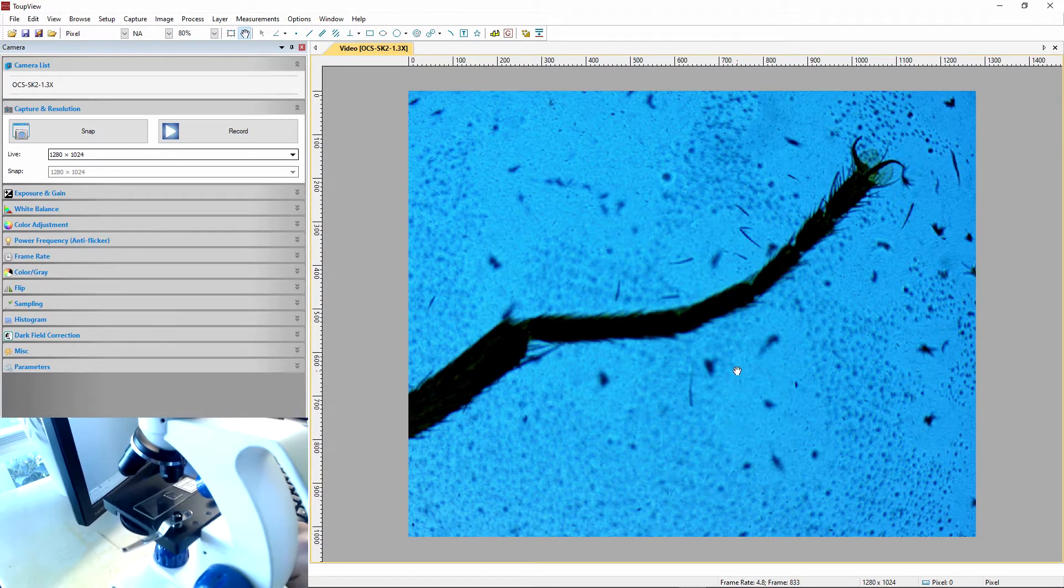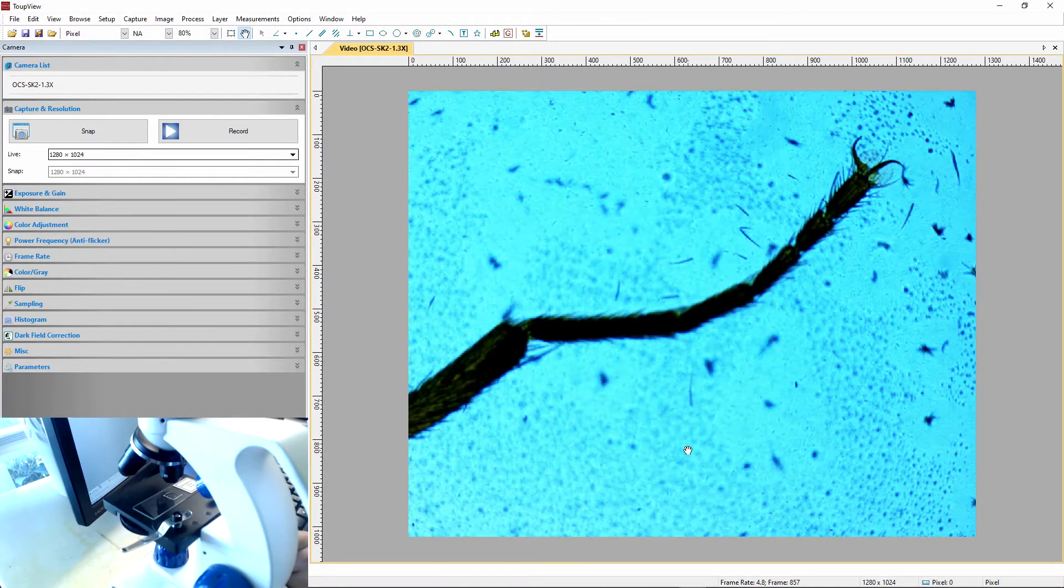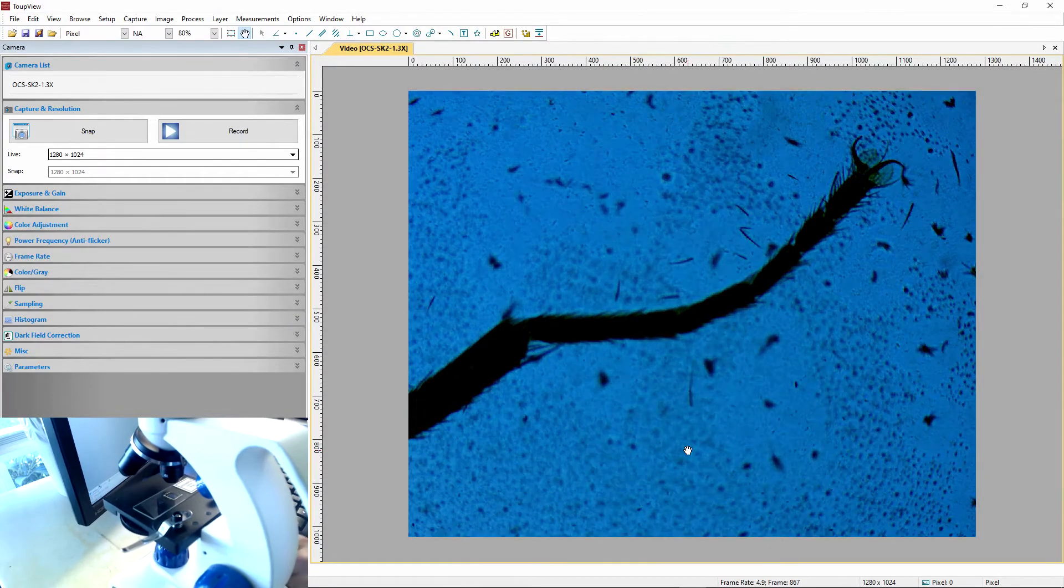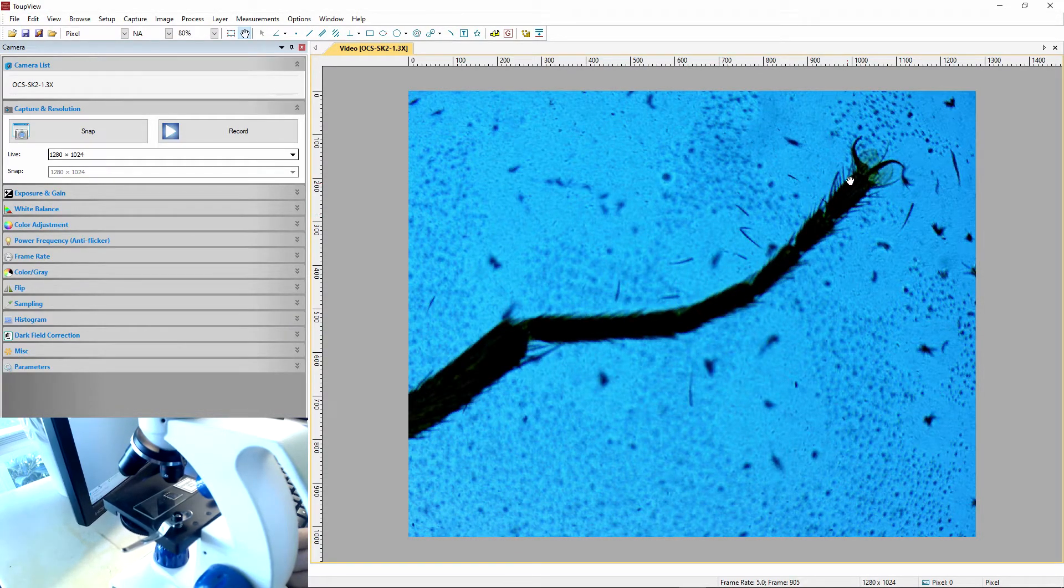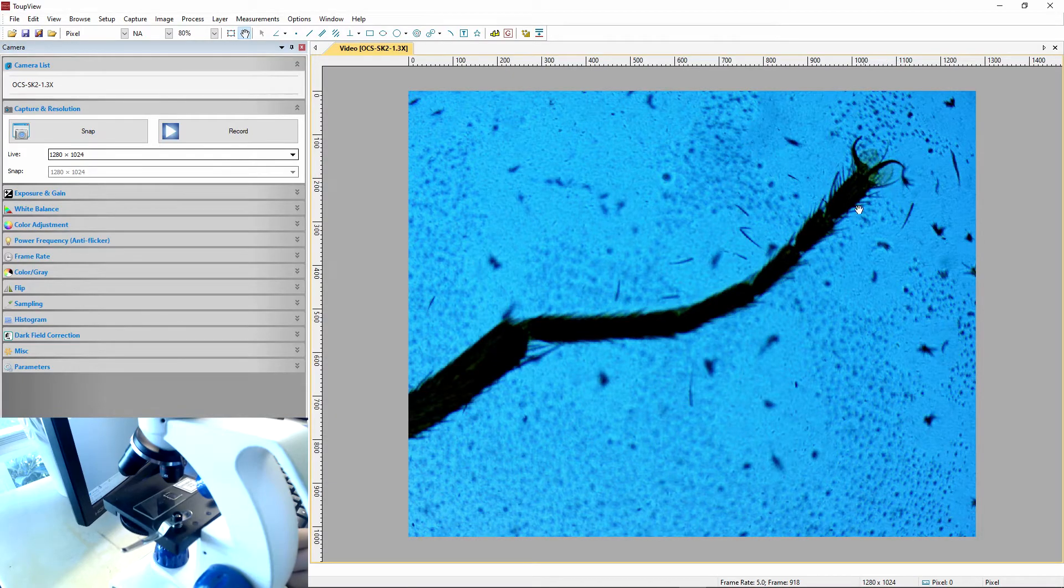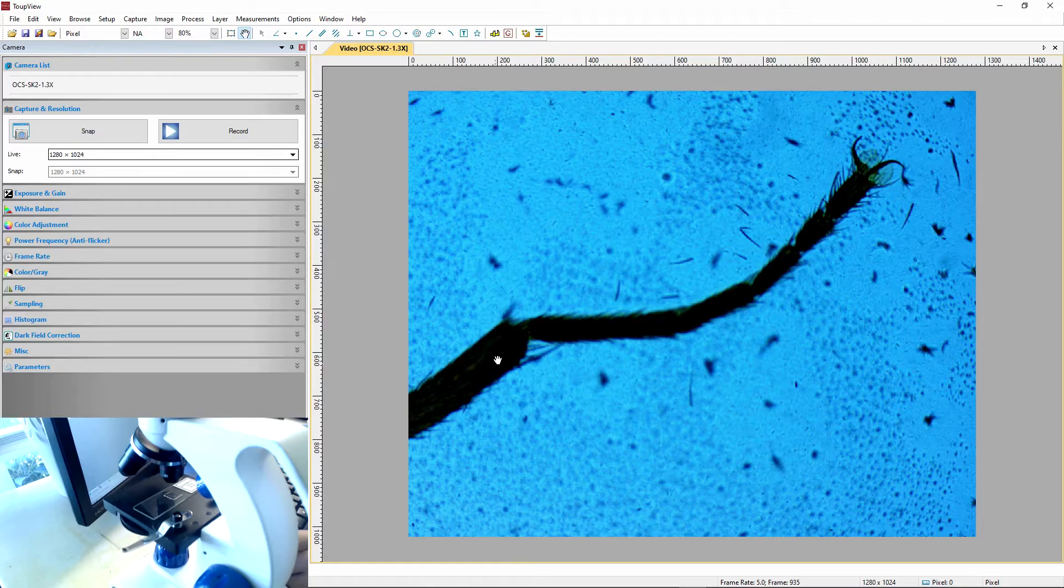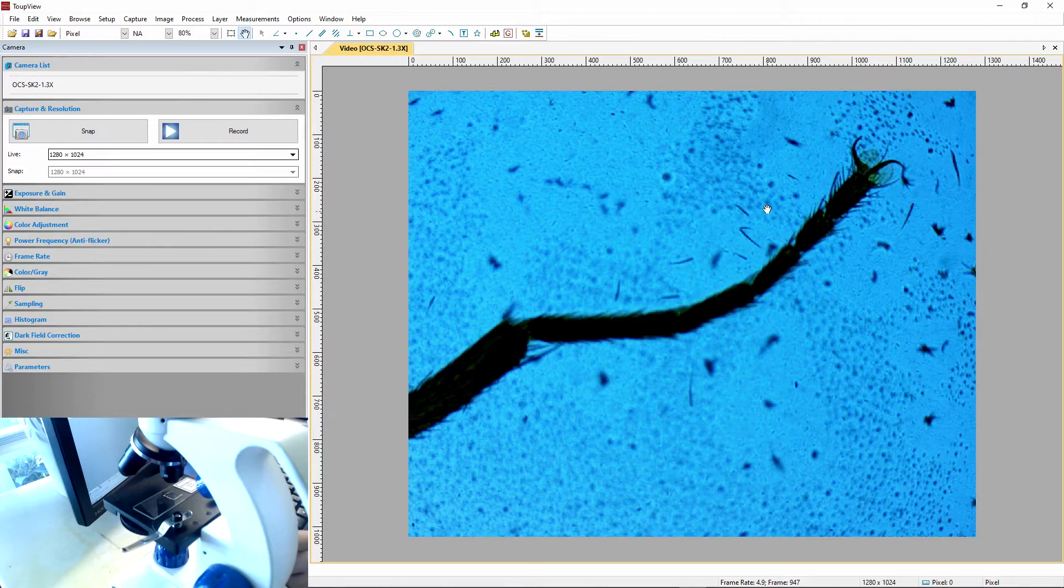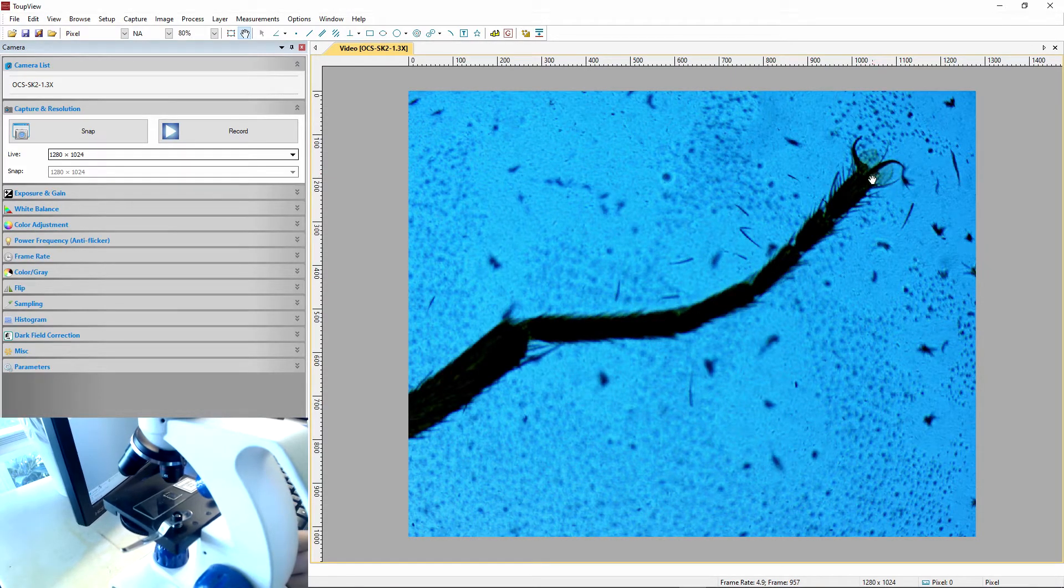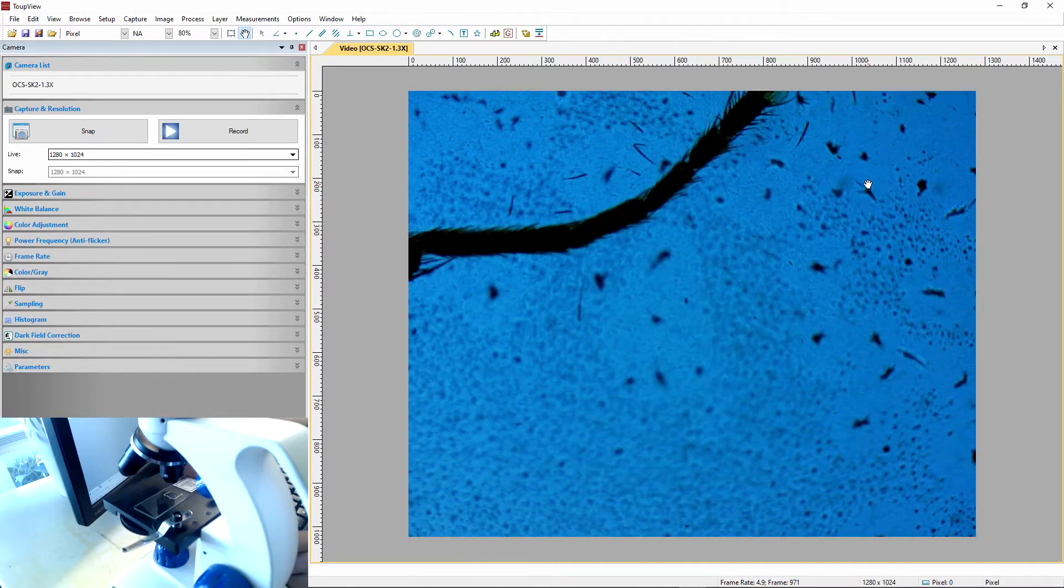That's gross. It's a... Turn up the brightness. I don't know if that... No, it doesn't change anything. So... I don't know what to say. This is kind of gross. It's a leg of a housefly, so you can see all the hairs on it going different directions, and there's some loose hairs, and there's barbs on the end, which is how they stick to everything. Or can land on everything.